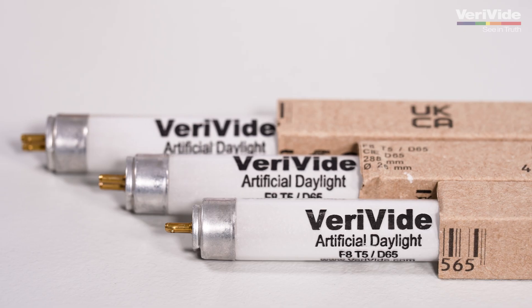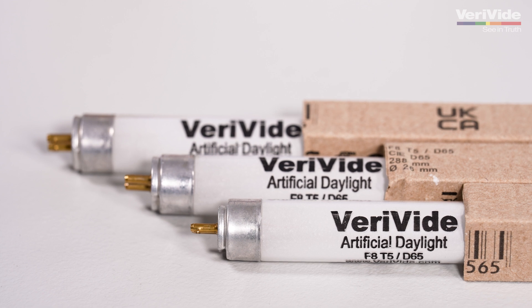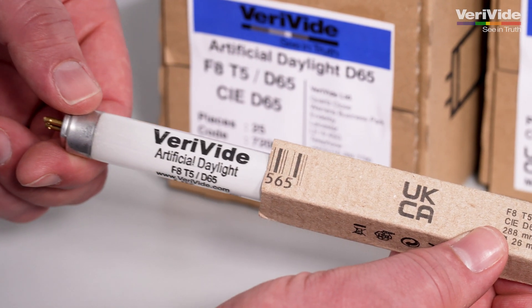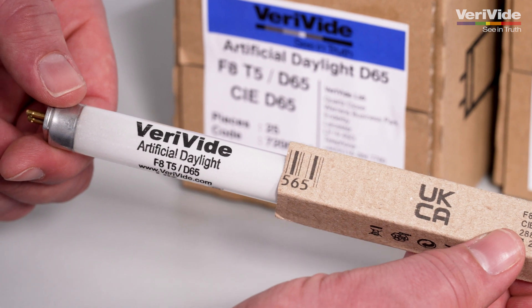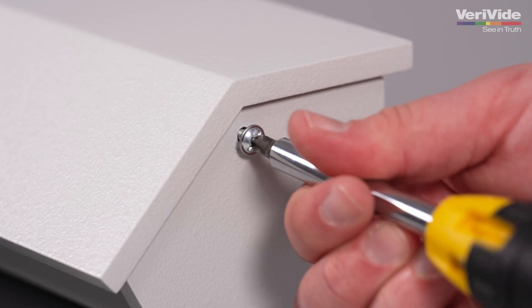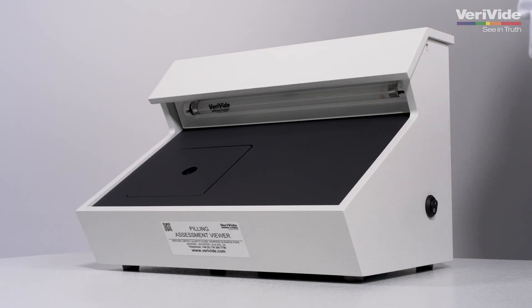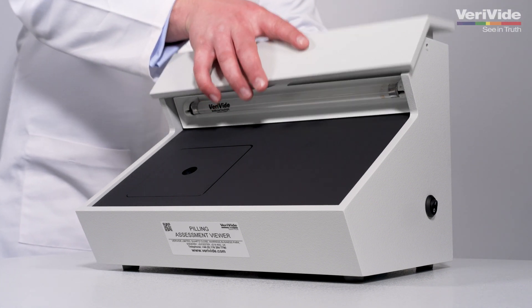These lamps are available directly from Verivide or through our international distributors. It's important for customers to check what lamps they are currently using and update to the latest lamp requirements as soon as possible to ensure test standards are met.